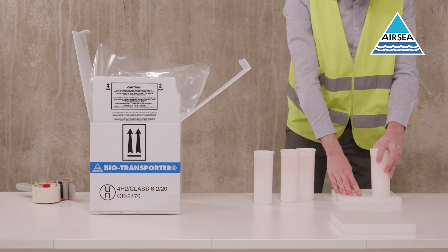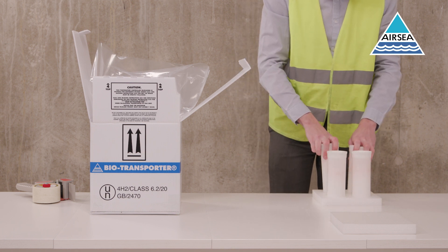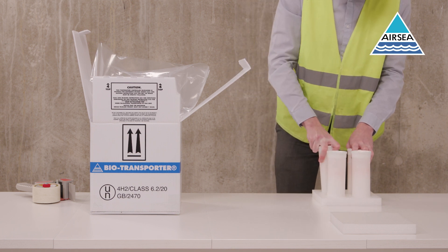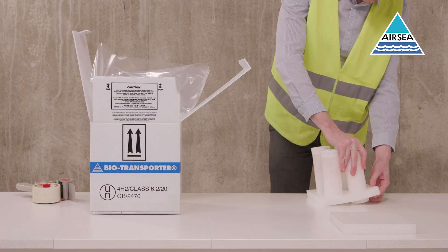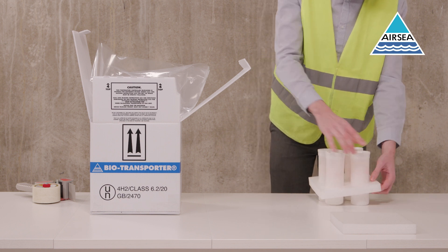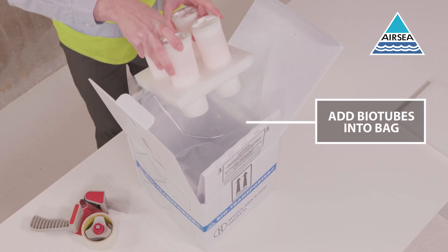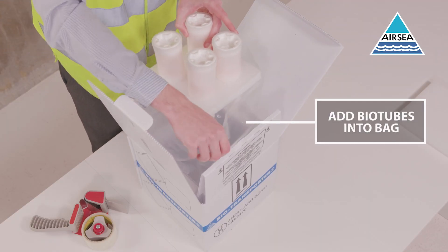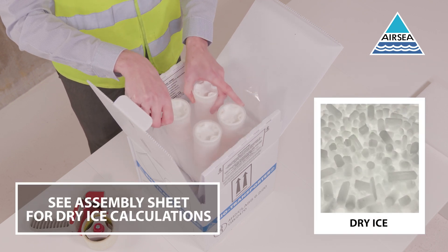Place the biotubes into the foam stabiliser. Place biotubes into the polythene bag and fold the bag over. If using dry ice, completely fill the polythene bag.